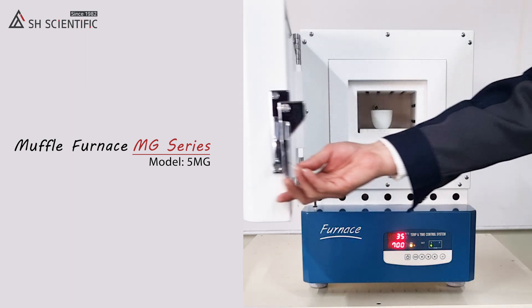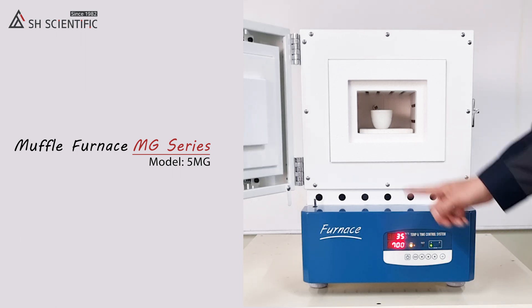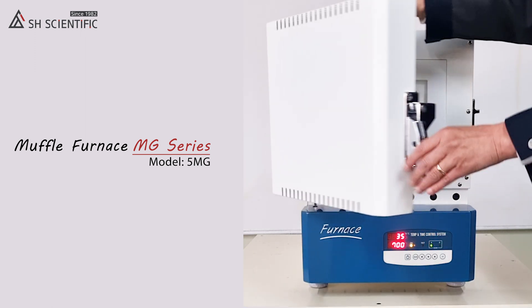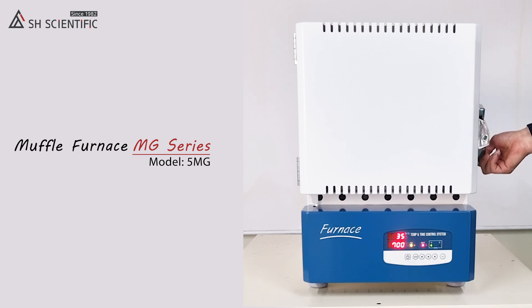Look at what happens if you open the door while it runs. Our MG series has a door limit switch at the left bottom part, and the furnace stops heating when the door is opened. No worries — it resumes heating when the door is closed.